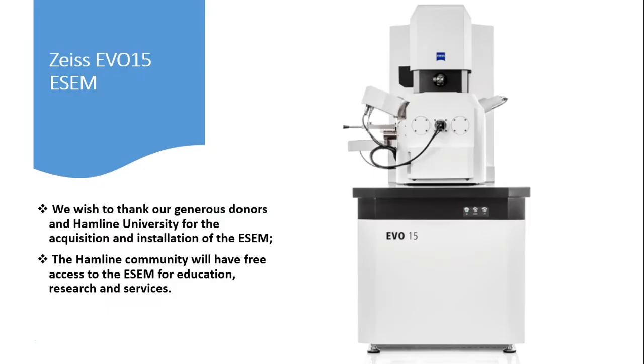First, we wish to thank our generous donors and Hamline University for the acquisition and installation of the ESEM. The Hamline community will have free access to the ESEM for education, research, and service.